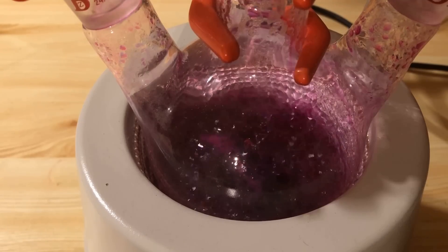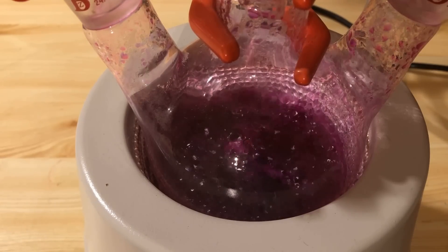Now the mixture is boiled under reflux for 2 hours until the solution is colorless.